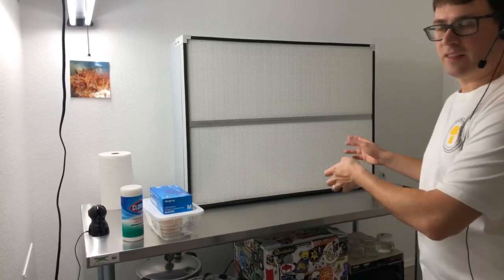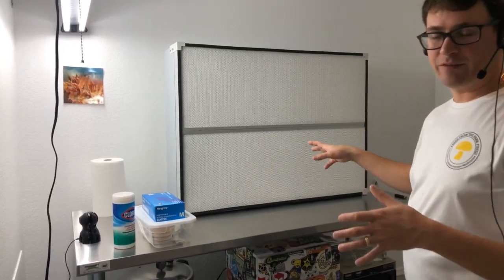It's Gary with Fresh from the Farm Fungi. I'm here in Castle Rock, Colorado at our Myco World Lab, and today I'm going to be testing the quality of this laminar flow hood.